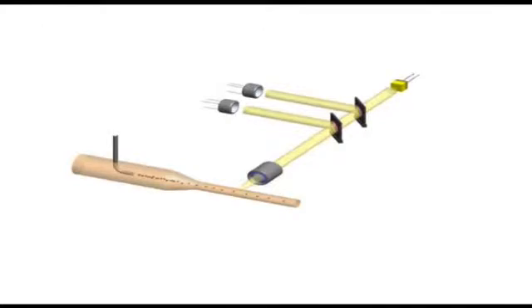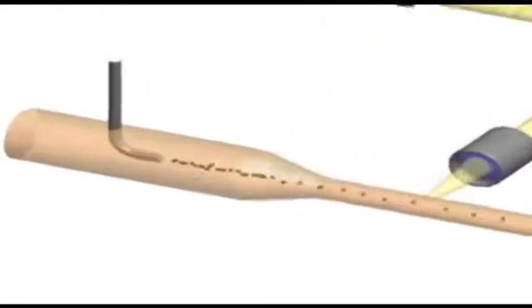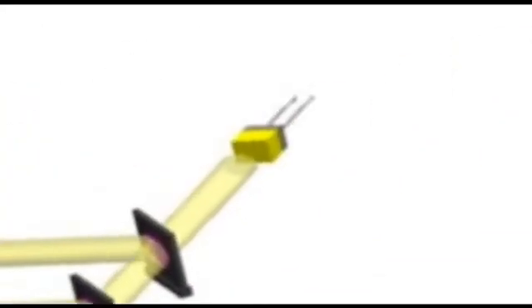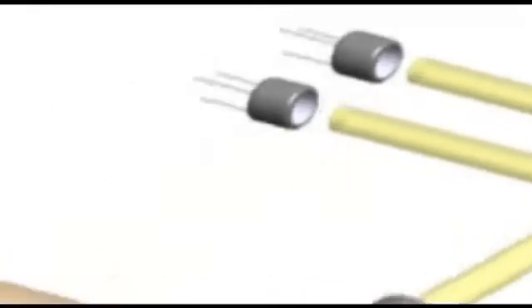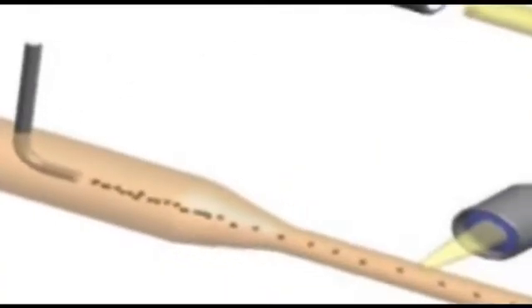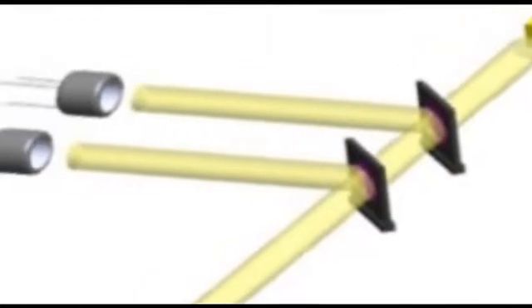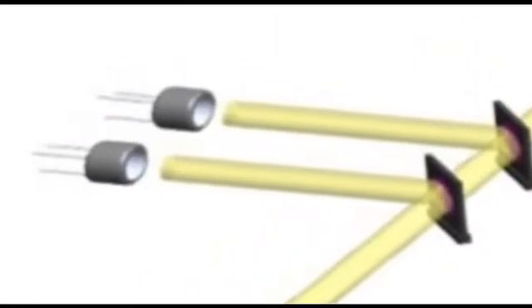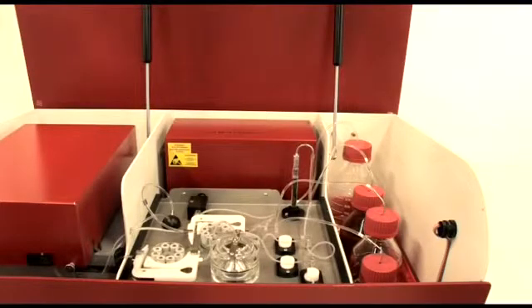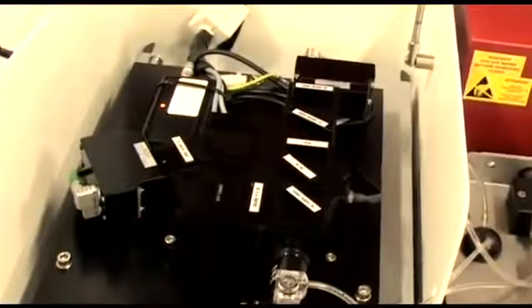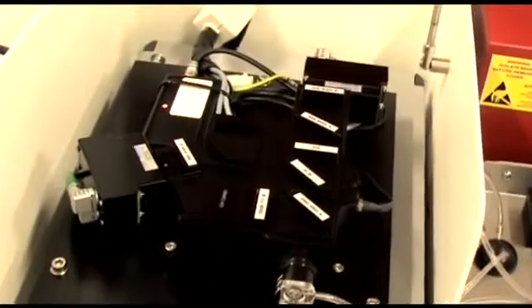The stained cells are passed one by one through the flow cell. The light of the power LED combined with the staining solution give the cells a fluorescent color so they can be detected by the two photomultipliers. The SomaScope Smart uses two photomultipliers to better separate the cell signals from signals of other material like bacteria.